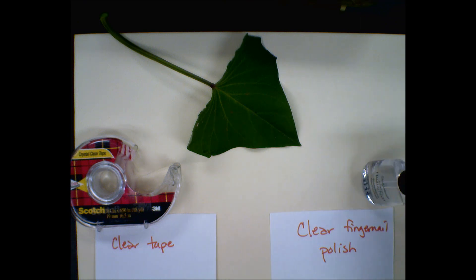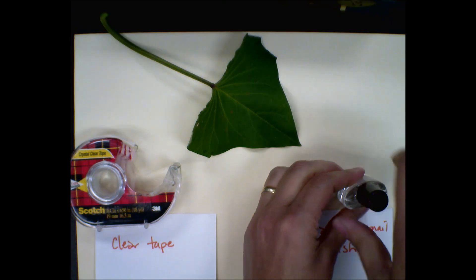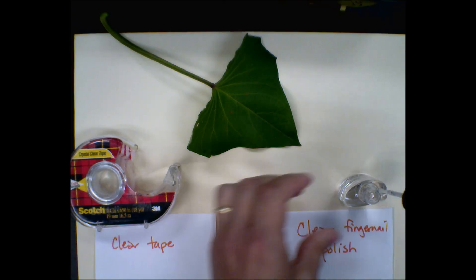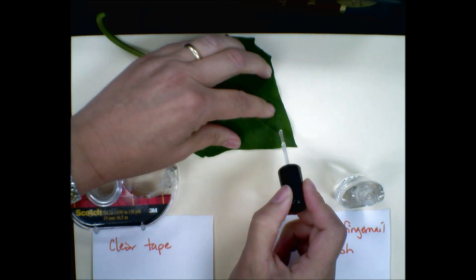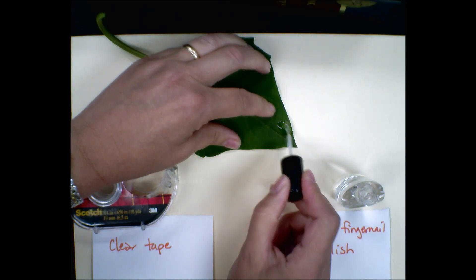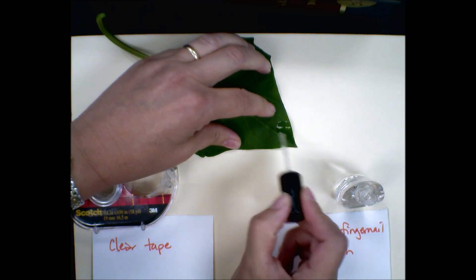So that's why we have some clear fingernail polish and some tape. What we'll do is put the clear fingernail polish just on a small portion of the leaf, and it doesn't need to be a thick coat because we want it to be thin enough that it'll go into the nooks and crannies on the surface of the leaf.